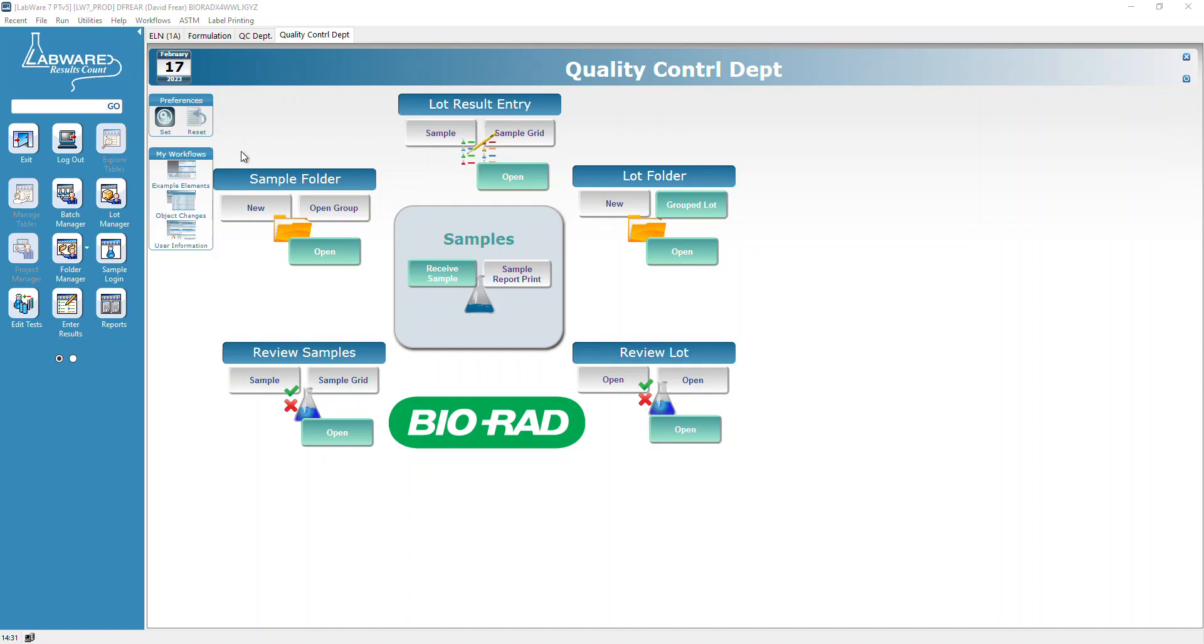Howdy folks, today we're going to talk about P samples. We're in PROD and I'm logged in as a QC tech associate.